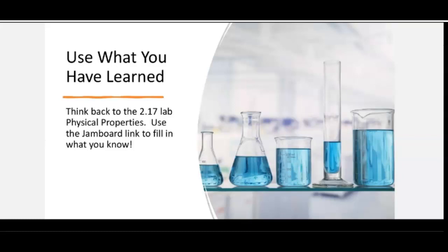If you go on to the next slide, if you've read through the lesson, part of it takes you through an oxygen splint test and 2 other gases. So we look at 3 gases, and we are just recording what we see when we watch these splint tests happen.